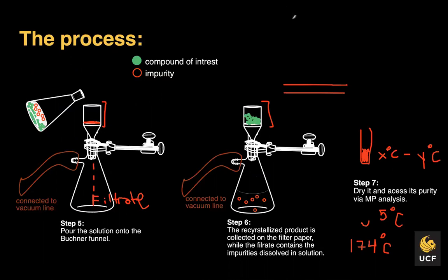The experimental melting point is on the discussion. I believe for the recrystallized NBS, it was 173 to 174. Okay, you should notice it right within the quiz, right within the writing prompt for the discussion. And it's on one of the quiz questions as well, that I did give you the temperature.